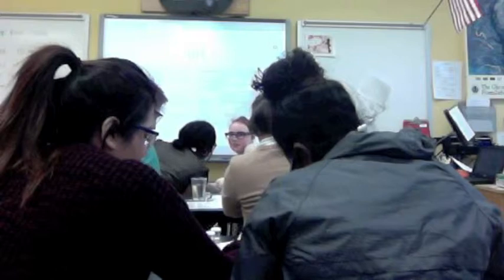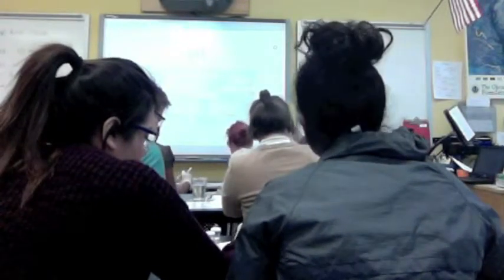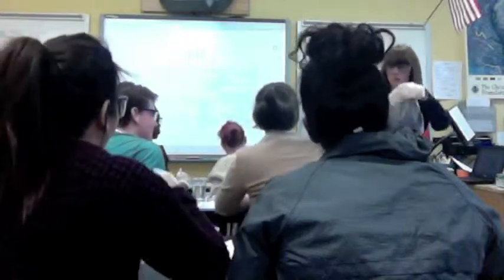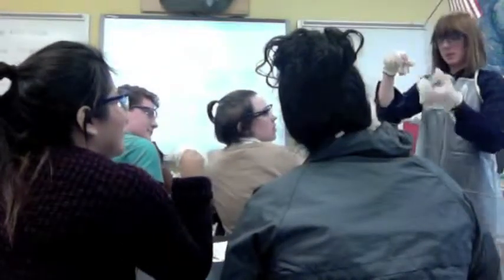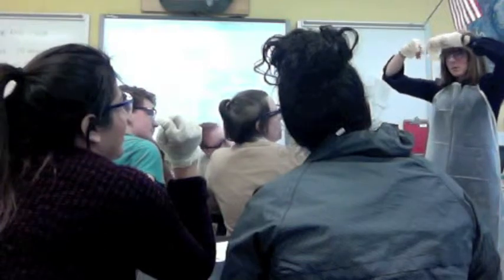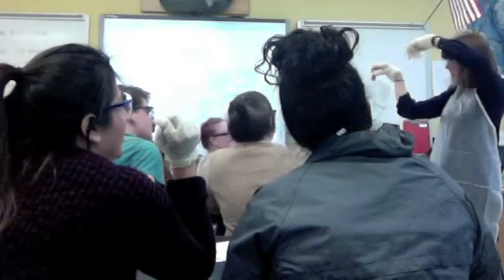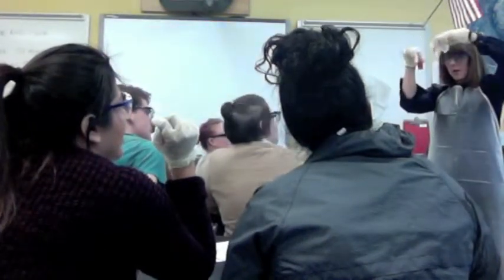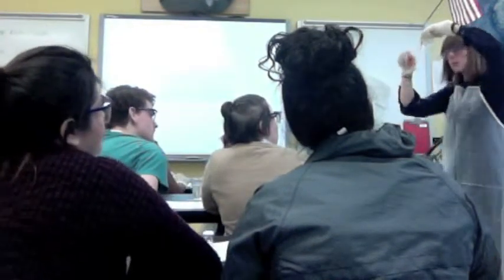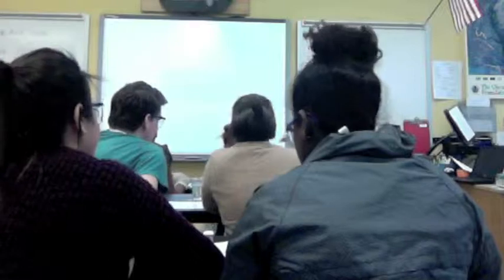One thing, since we're done with our nitrates, that I want to point out is look at the difference in our nitrate levels here. Yours is better than ours, and this is the tap water. This is the saltwater fish tank, which has had the live rock, and also what else does this one have that these don't? Salt. This is a much higher salinity level.